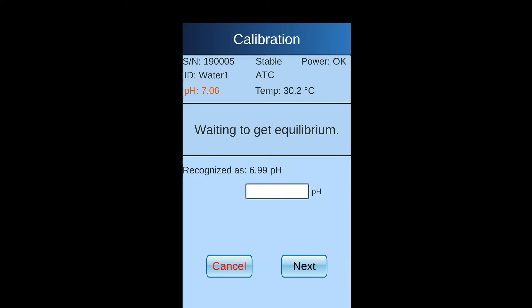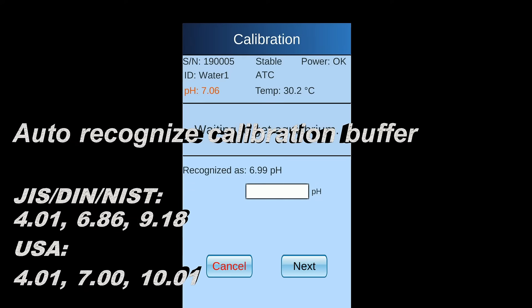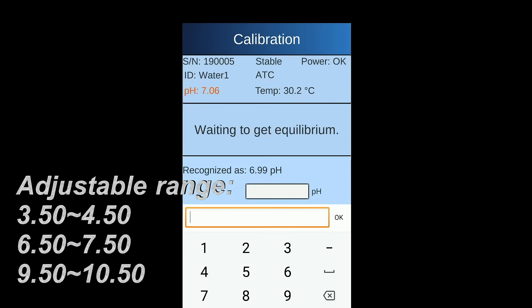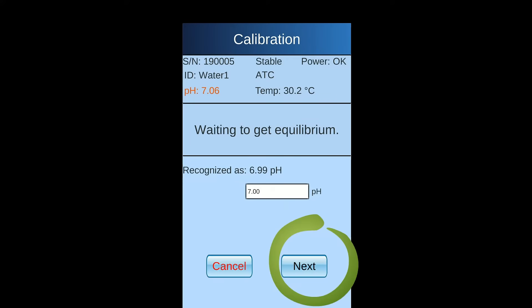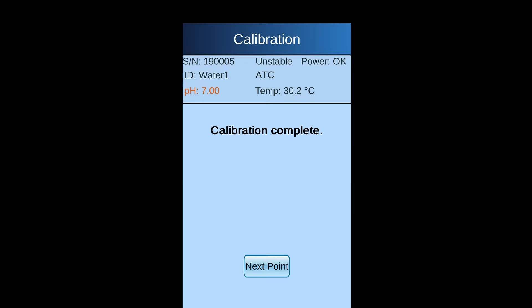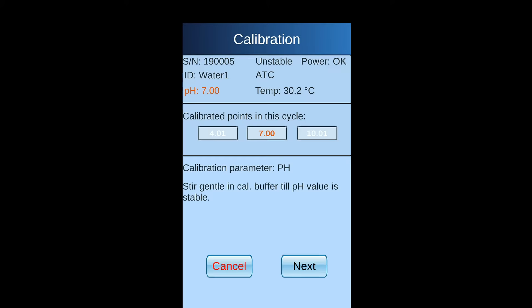PH pen will auto-recognize the buffer. If the recognized value is different from what you are using, you may adjust it or you may directly press next key to next page. Stir gentle till the reading is stable and you will see calibration complete appears. Press next point for more points.